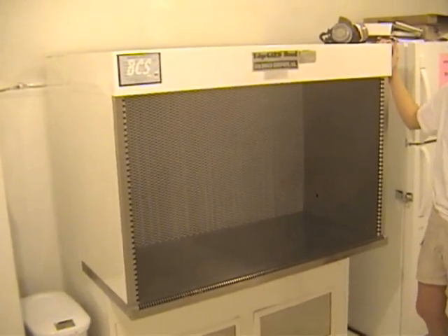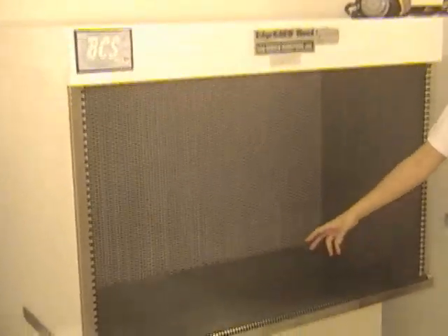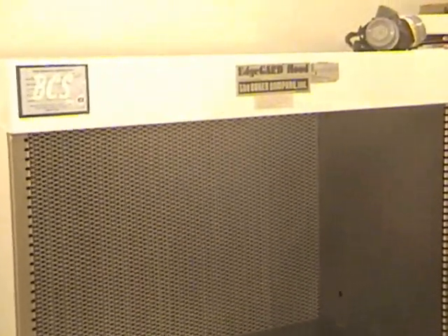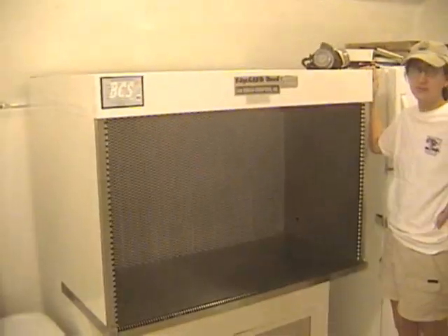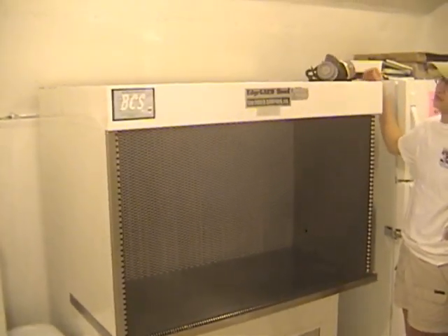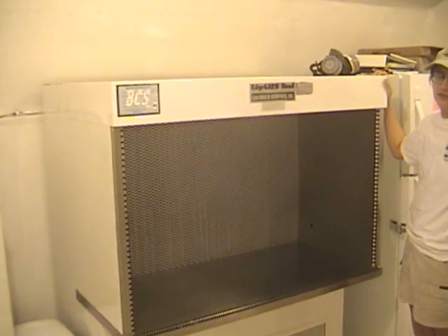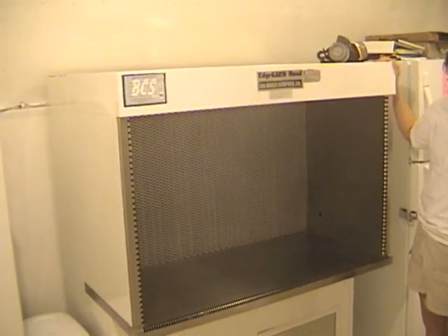This is a hood, and it was actually donated by one of our customers. We can process venom in here when it's on, and it will pull everything back into the filter system so that we don't have to worry about inhaling venom particles that may become aerosolized. This rebreather up here is also used when we're weighing or working with the venom — it reduces the risk of exposure, since it is possible to develop an allergy to venom when you're exposed to it over and over again.